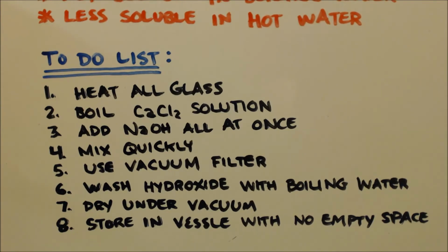You think about it, I made that calcium hydroxide. When I was filtering everything, maybe 15 minutes went by, and then the video was over, and I brought my frit funnel downstairs to put some acid in it to clean it. Now, before I finished the video, I threw a little chunk of the hydroxide in some acid to see if it fizzed at all. And it really didn't fizz. So that was good, telling me that there's no carbonate in it. I brought the funnel downstairs. That must have been another 15 minutes. So a half hour between making it and doing this filter thing.